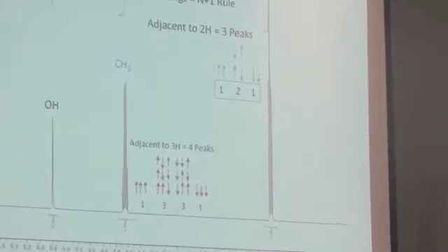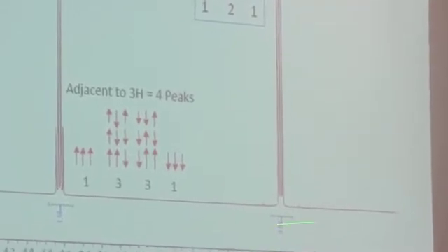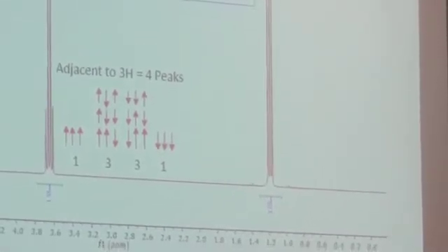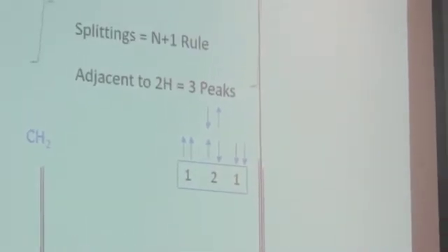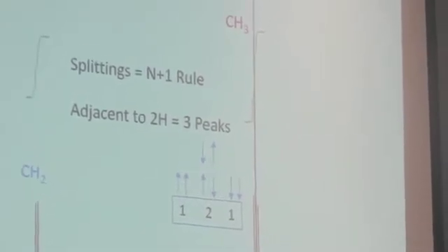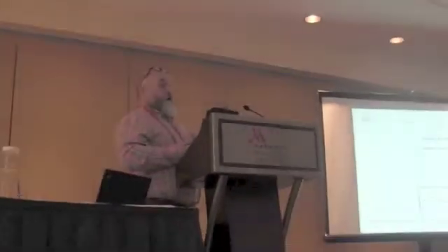It's always going to be down in this kind of region of the spectrum. CH3s from all kinds of molecules are down in this region of the spectrum. And what happens is, when this CH3 is sat next to this CH2, the hydrogens on this guy, a proton is like a little planet, right? You imagine a proton of an atom. It has spin, it's spinning like a planet. So when you have a charged particle, a proton, spinning, it generates a magnetic field.